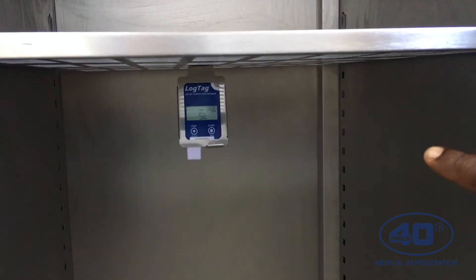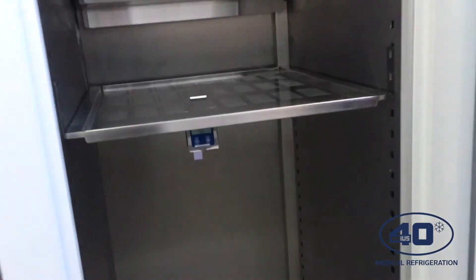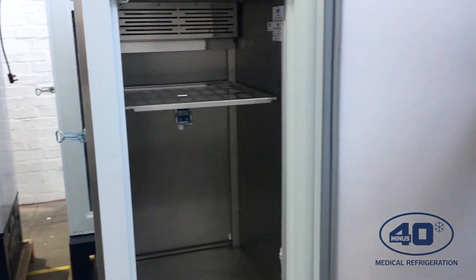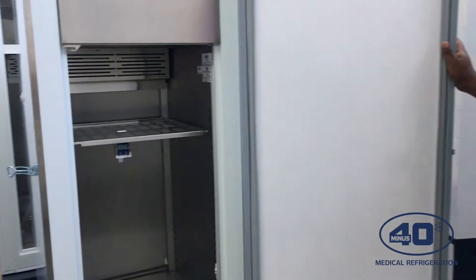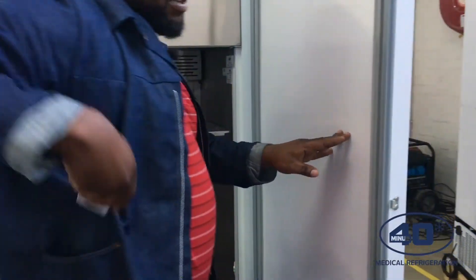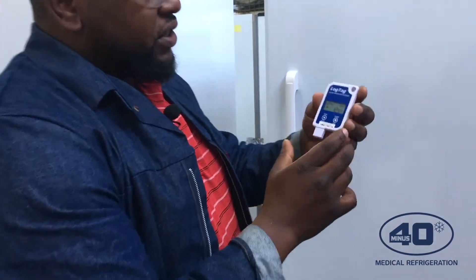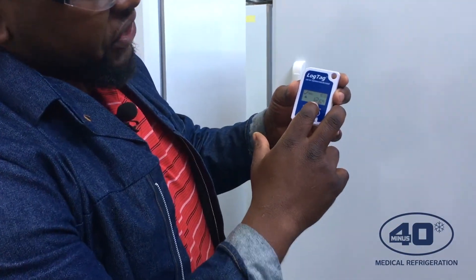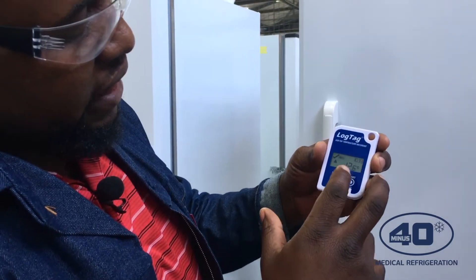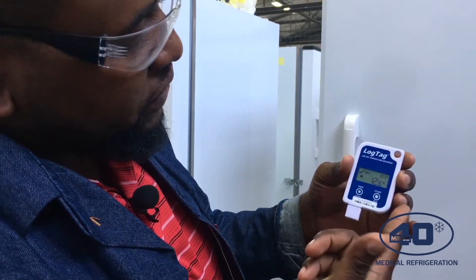After the delay of 30 minutes, you will be able to start getting accurate readings of the fridge temperature. The display will show you the fridge temperature and the time. In case there is an error or the temperature is not between 2 and 8 degrees, you will be able to see an error on the display as well.